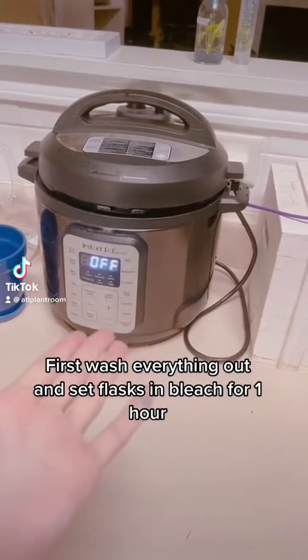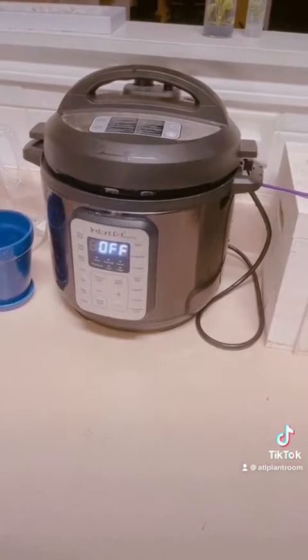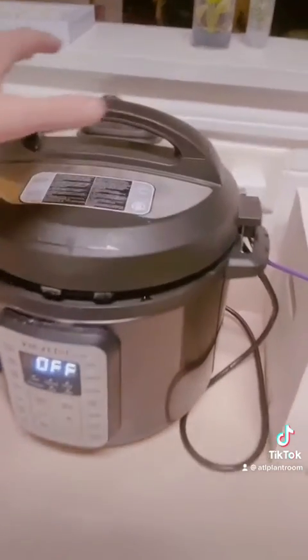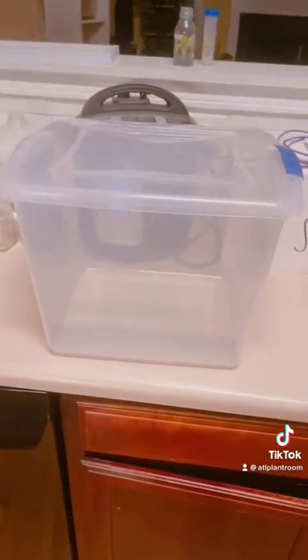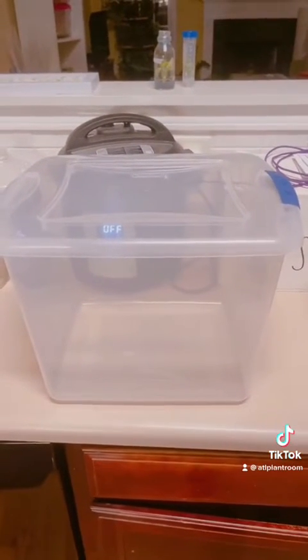This is how I clean flasks using an Instapot. This is before I create any type of media or anything. I already have some in here. I'm in my kitchen so I'm going to put them in this to bring them downstairs and put them in the sterile room where I store them.